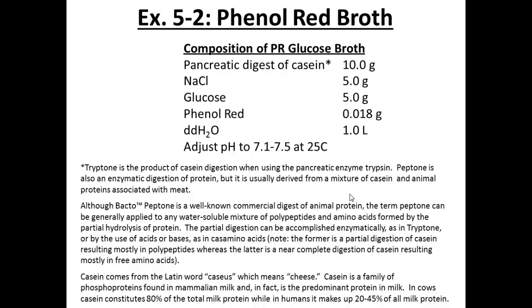So I always use the little story of, I've got the hamburger frying on the grill, but it takes a while to cook the protein. So in the meantime, I'm eating candy, my sugar, before my protein is ready. And a lot of organisms are like that. They're going to eat the sugar first. But there are some that don't ferment the sugars and go right to the protein. We actually have two of them, and I think Shannon has one of them, which is why yours is pink. And it's supposed to be pink. And you'll also see that there's no gas bubble, where there's a little bit of a clue with Yvonne's, because you have a gas bubble, don't you?